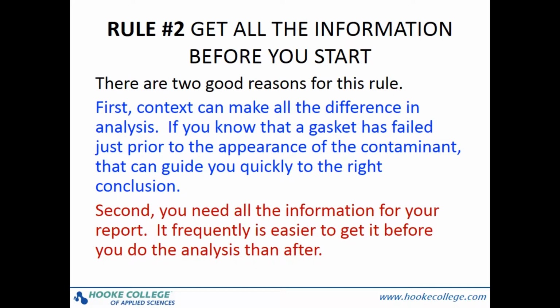By the way, once or twice I have received the wrong samples for the investigation. Two investigations were going on at once and the samples got mixed up. Getting all of the information first saves a whole lot of time and headaches later.